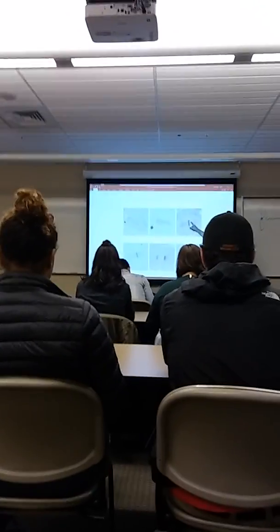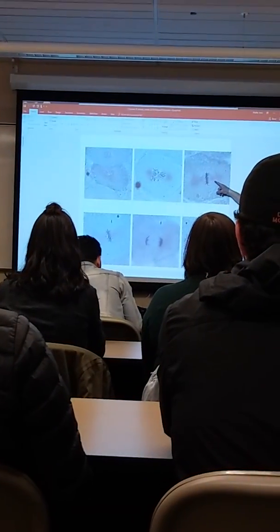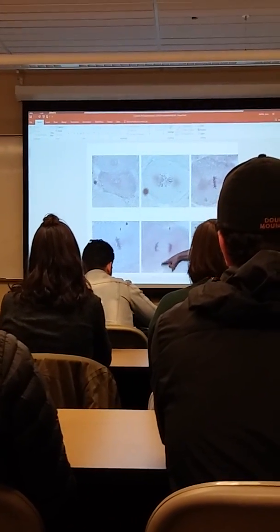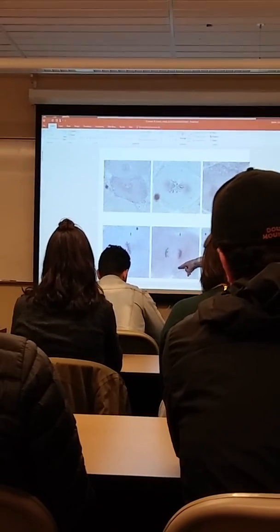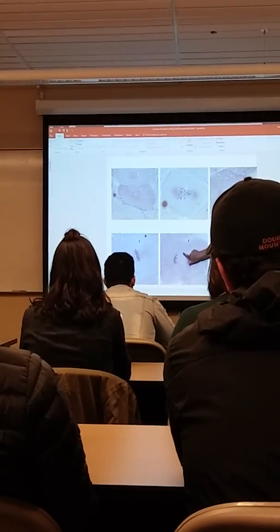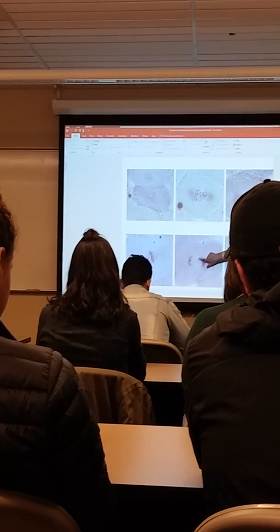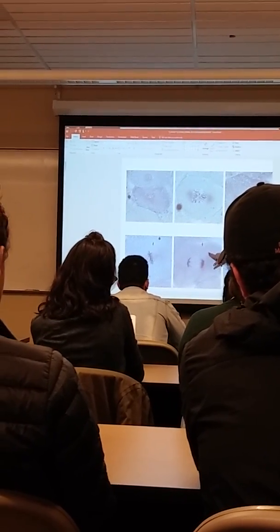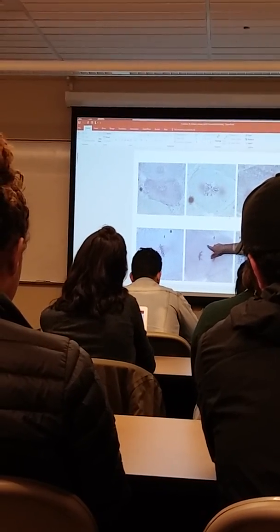You even see my mitotic spindle, those microtubules. I know this is still metaphase, and I recognize this as anaphase, because now I can see a separation from them. I can see the remnants of the mitotic spindle. It's actually helping to push these centrosomes further apart. And again, I don't see any nuclear membrane.